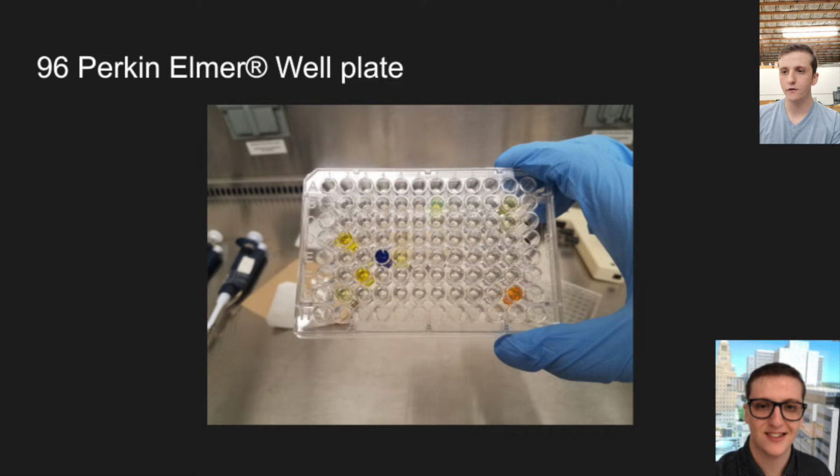The standard format microplates can hold up to 96 different chemicals, which is what we were using in our experiment. And after these chemicals are moved from the source plate to the recipient plate, the pin tool needs to be washed and dried between each of these cycles.